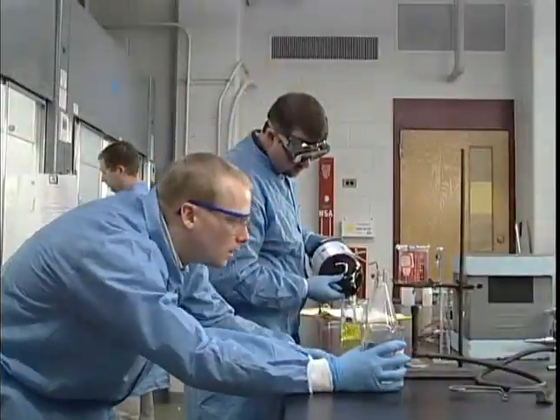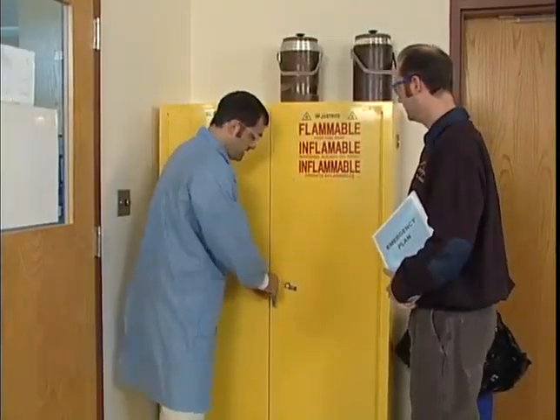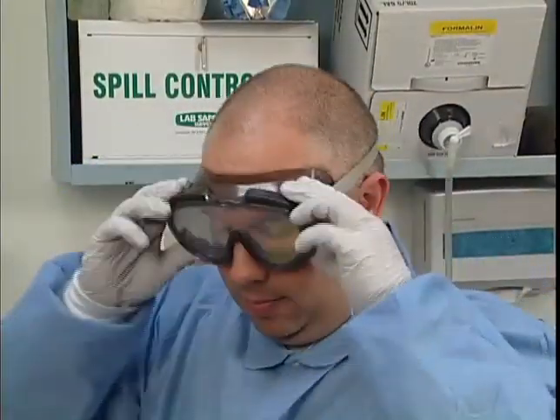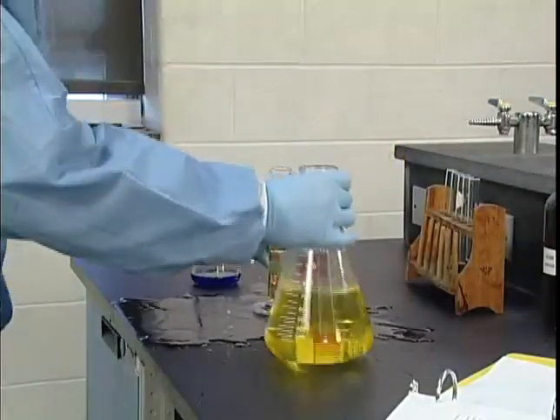So how can we work with hazardous chemicals safely? How should we handle and store them? What personal protective equipment should we use? And what should we do in an emergency?